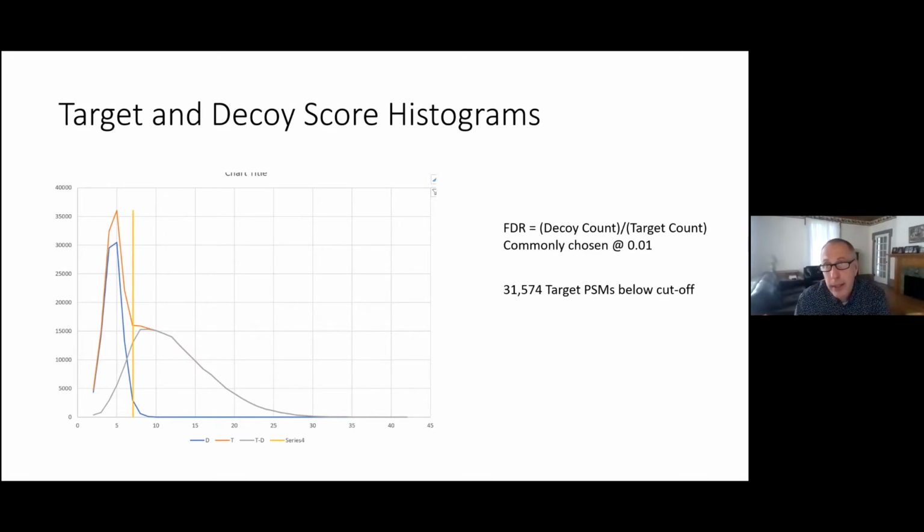And I'm just going to make up an answer: quite typically in these kinds of experiments, if we choose a 1% cutoff, we have lots of fun things to look at. We're not feeling too compromised. I will tell you though, that in top-down experiments, and I'm not really talking about top-down experiments here, the number of different things we identify in a DDA type top-down experiment of complex samples is really low. We get a lot of PSMs for exactly the same thing over and over again. There's very little variety. It's only the most abundant proteins and the lowest molecular weight. And so typically all of the interesting stuff is missing. It's too low intensity, it's too big for a mass spectrometer.